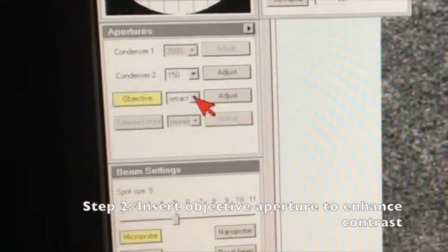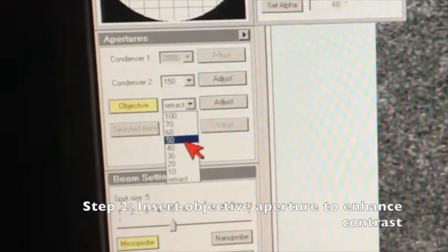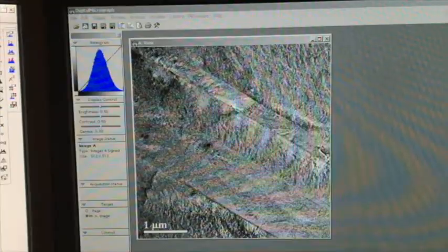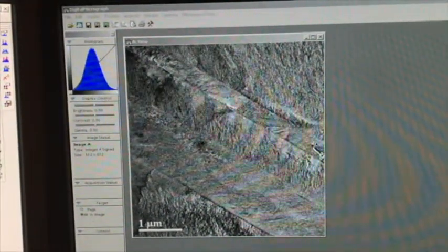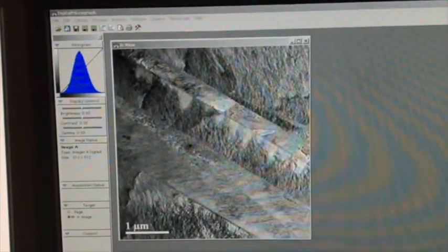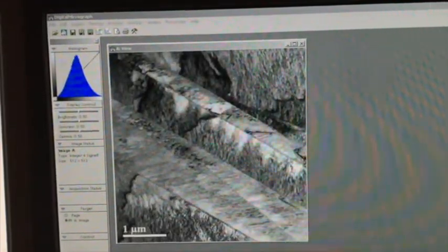In order to enhance the microstructural features, we need to insert the objective aperture. To insert it, go to the apertures window and click on the drop-down menu. There are many sizes you can choose — let's try 100 microns for now. The image we see right now on digital micrograph is without any objective aperture. Now let's insert the 100 micron objective aperture. You can see the contrast gets slightly better. Now let's try an even smaller aperture, like the 50 micron objective aperture. The contrast gets even better.